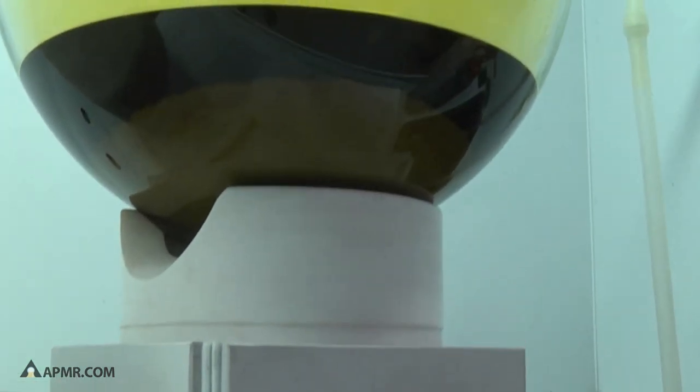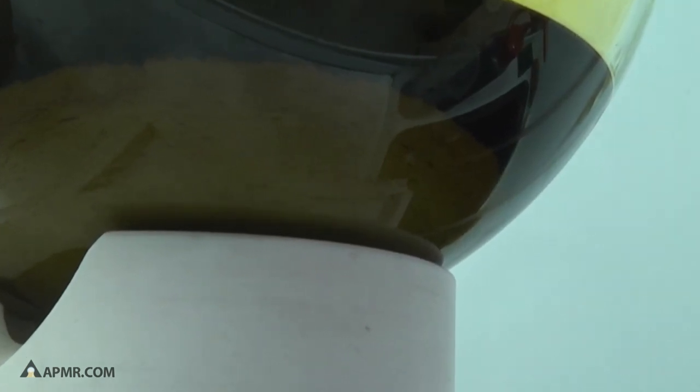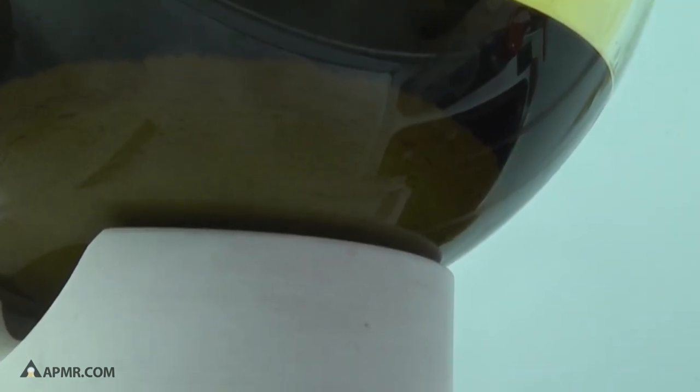In the bottom of this flask, you're going to be able to see the silver chloride that has formed and precipitated to the bottom of the flask.